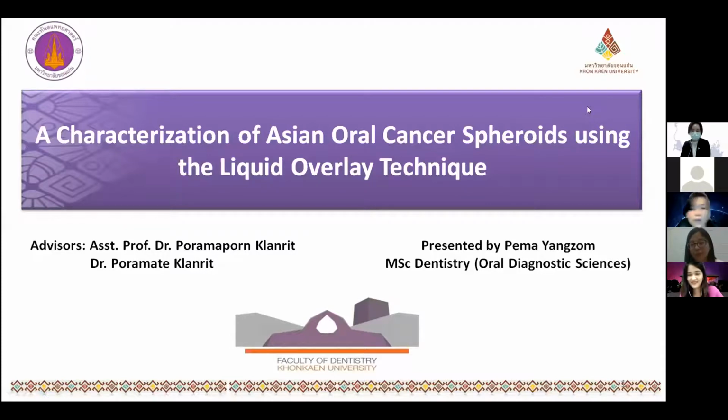Well, it's very interesting. So you are the first to use the liquid overlay technique to increase the number of oral cancer cells, right? Yes, Ajahn, as per my knowledge. So the question is, you just have the 7 days, right? Yes, 7 days. So I want to know, did you experience any contamination? Oh, actually, I experienced contamination several times.